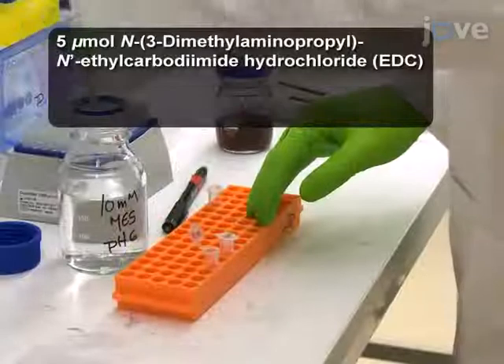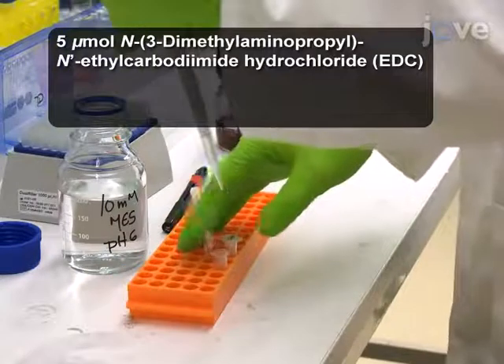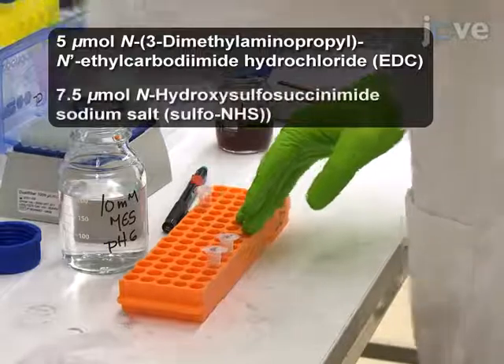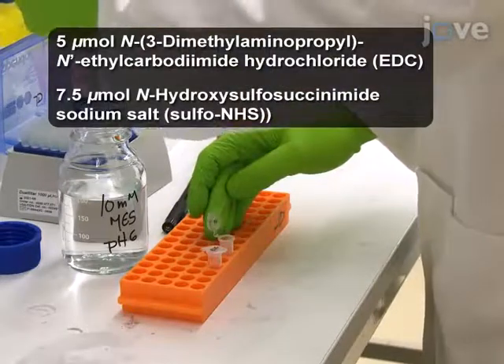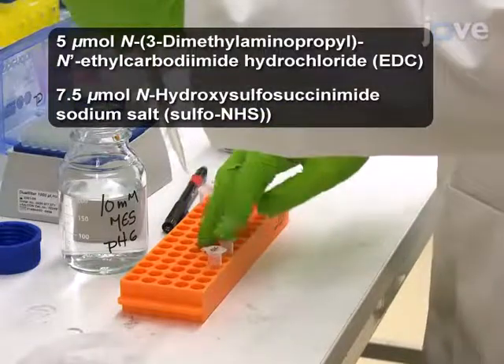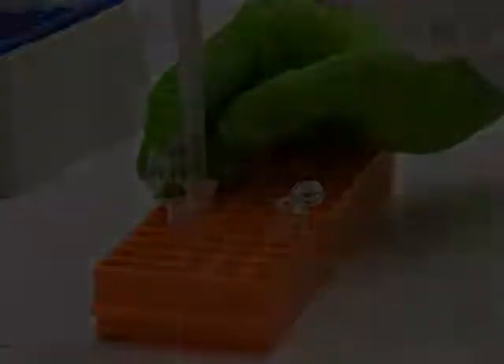Next, dissolve 5 micromoles of EDC in 250 microliters of the 10 millimolar pH 6 MES buffer. Dissolve 7.5 micromoles of sulfo-NHS in another 250 microliters of the MES buffer. Combine these solutions with the PEG-modified gold nanoparticles.